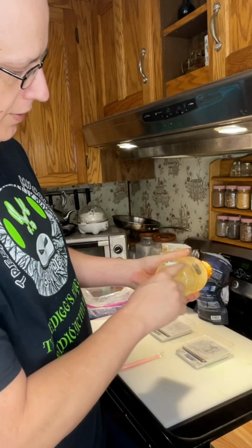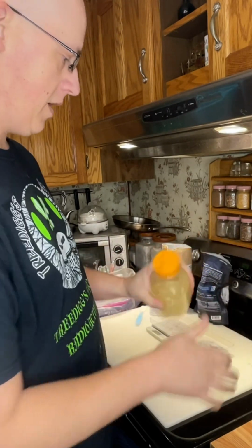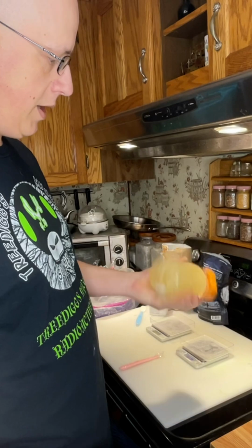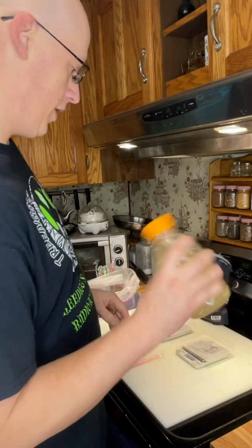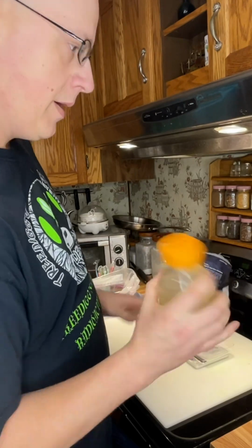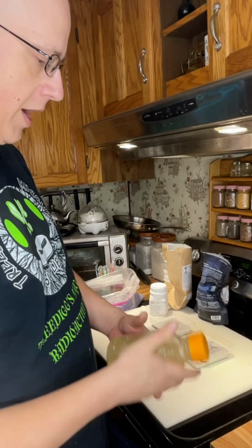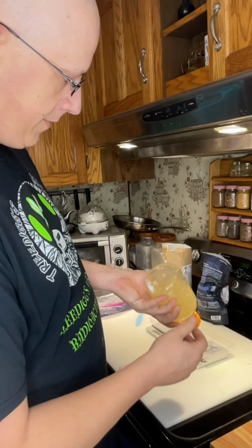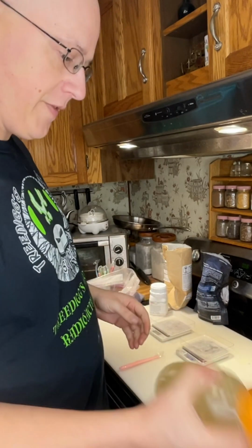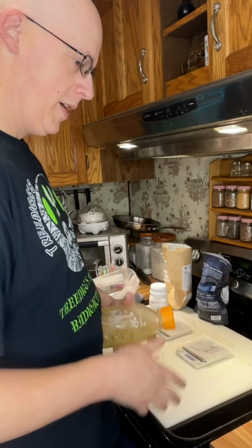Definitely I'd rather see all this stuff mixed in, because all of this is going to turn into chunks that I'm going to have to filter out later. But we'll go ahead and throw it in the microwave, get it cooked up, see how it goes. An alternate method would be to add it to cold water or cool water on a stove top and use some sort of blender mixer. Maybe get it to work better. I've talked to some folks that have had that work. I think Outback Mycology was saying that worked well for them.